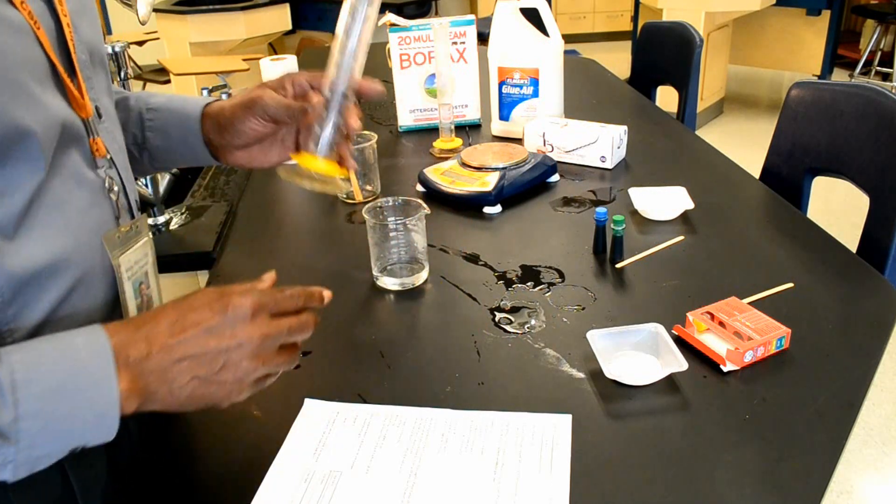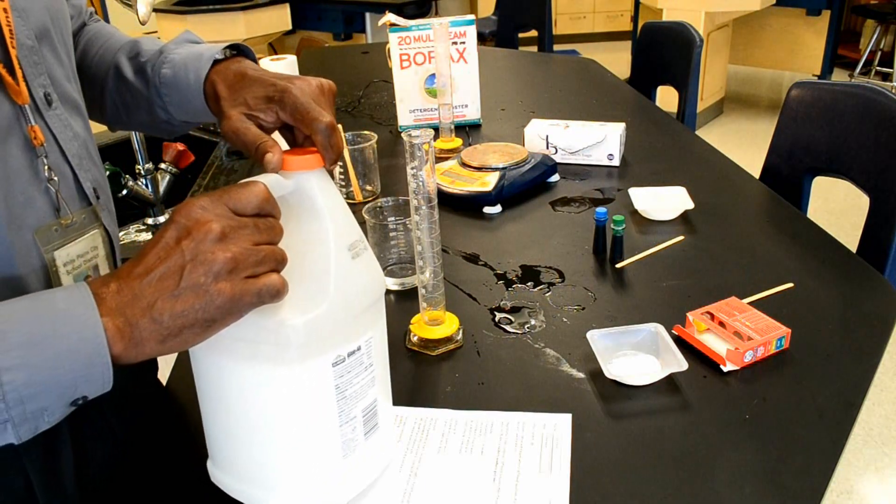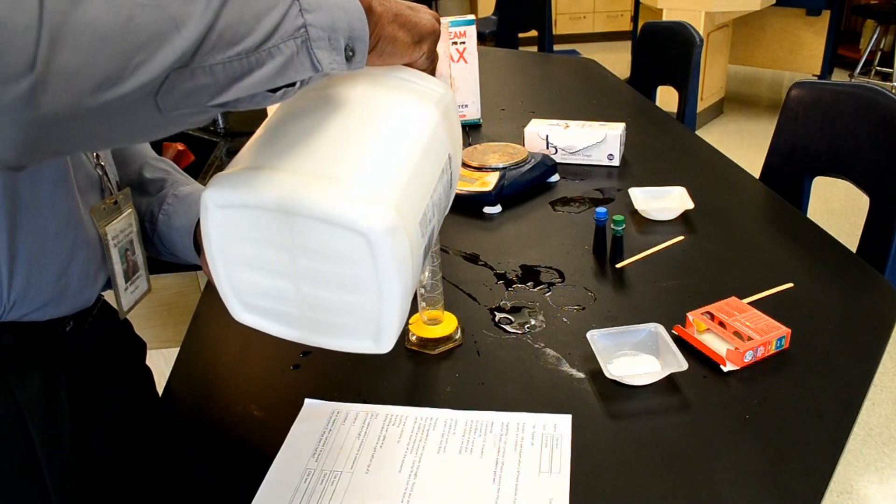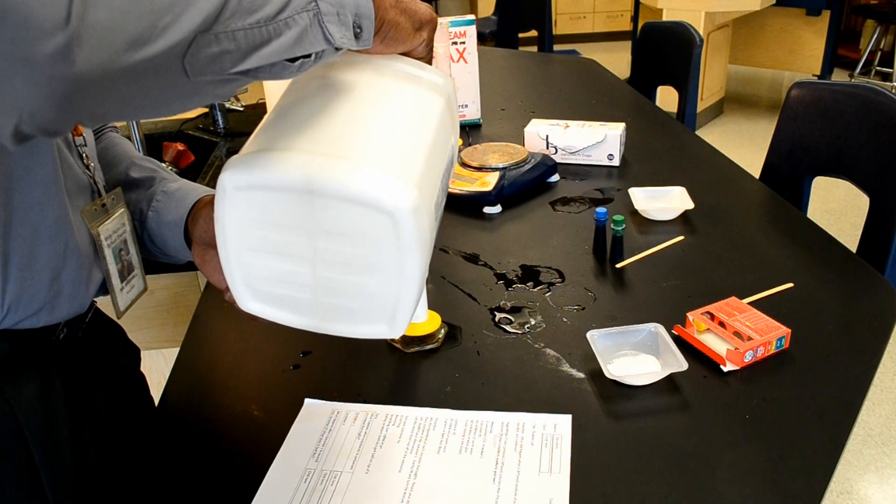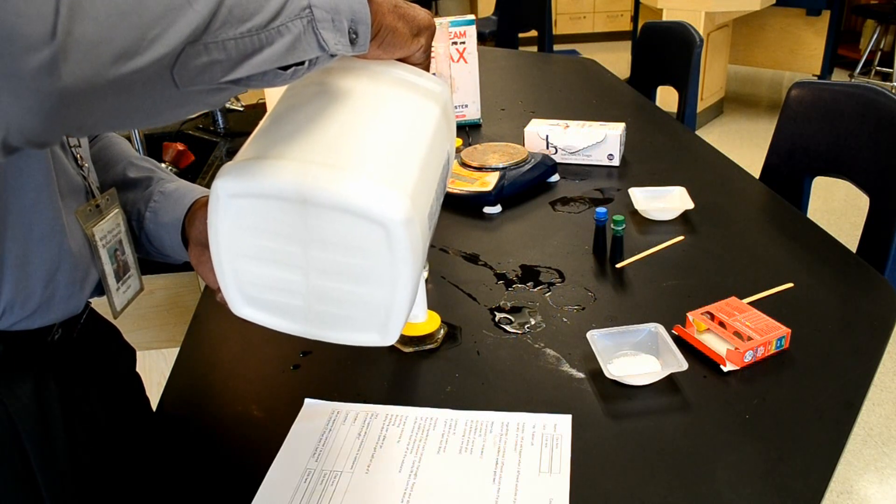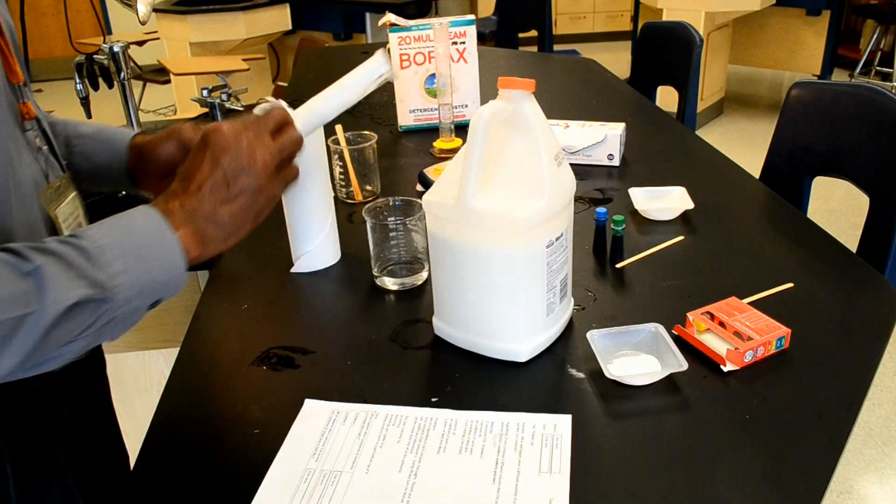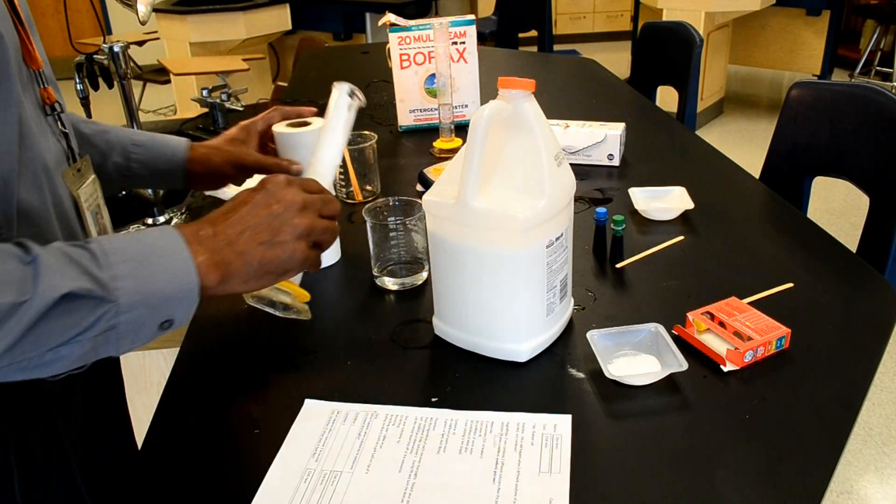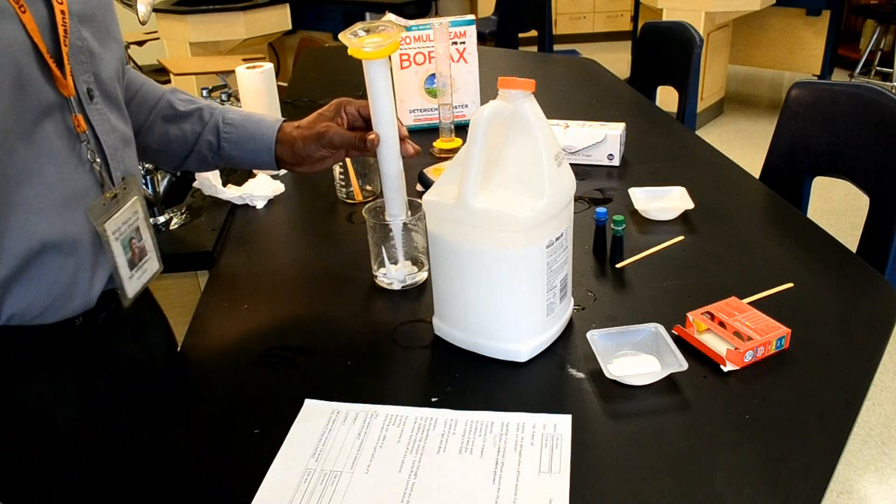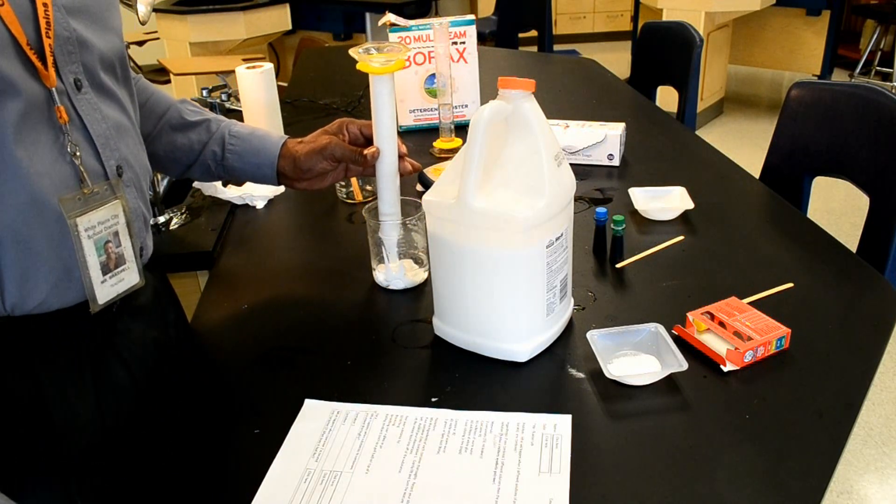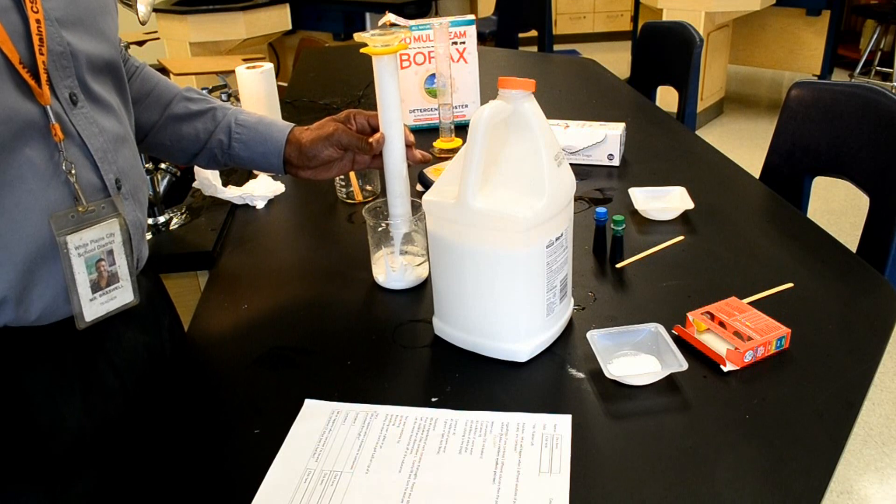Now, using the same graduated cylinder, I'm going to measure out 80 ml of glue. Remember, the glue provides the polyvinyl acetate molecules that we need to make the flubber. That's about 80 ml of glue, and we're going to add this glue to the water. Since glue is very viscous, meaning that it flows very slowly, this is going to take some time to get all the glue out of the graduated cylinder.